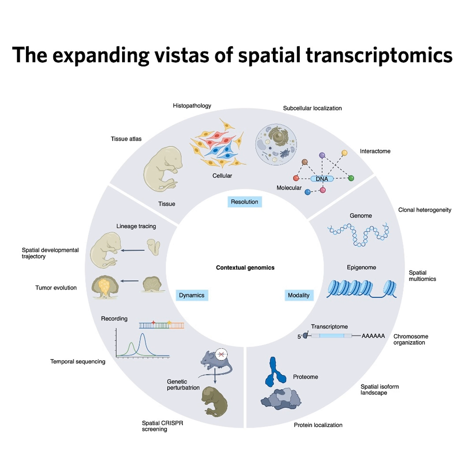Okay, SST. I'm picturing that coming more from the traditional genomics lab, the sequencing world. That's pretty accurate, yeah. SST really leverages all the amazing advances we've seen in massively parallel DNA sequencing and molecular barcoding, very similar actually to the tricks used in single-cell sequencing. And the core mechanism is? Molecular capture. The basic idea is you use a special surface, like a microscope slide, that's coated with DNA primers. But here's the key.